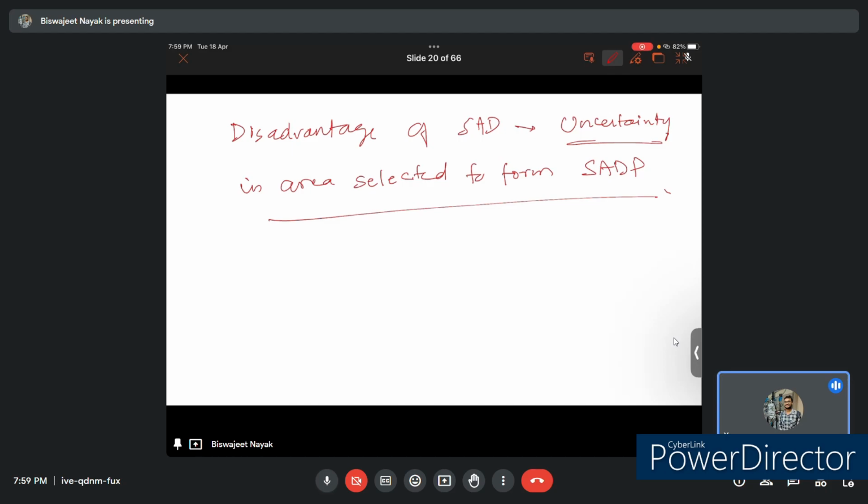To do that, the details about the images can be determined by the intensity of the electron beam, and this intensity varies for different positions in the image.